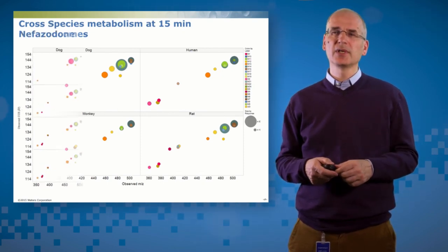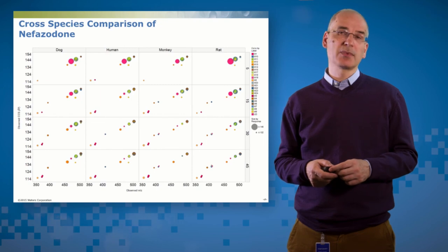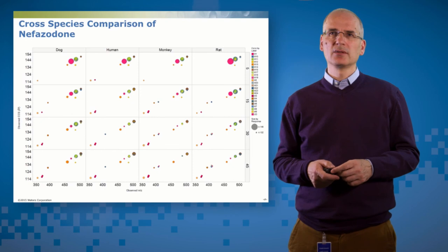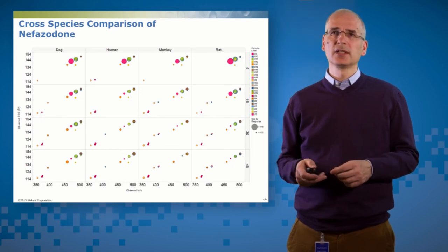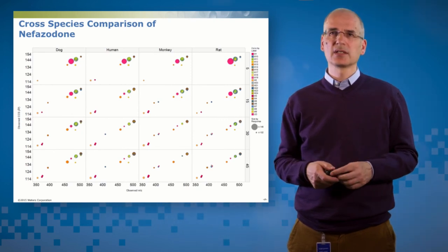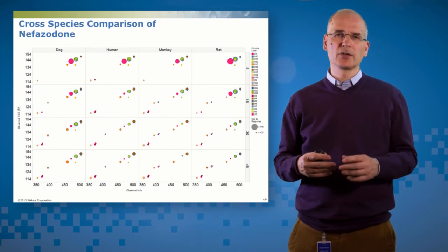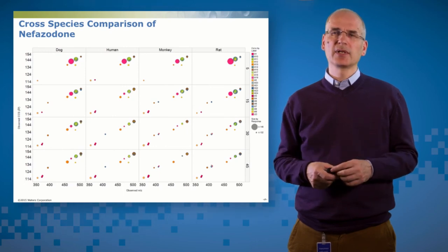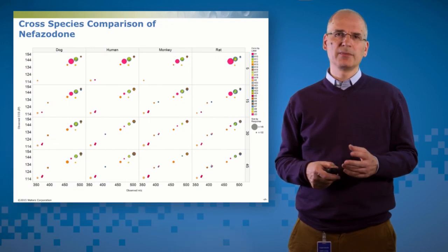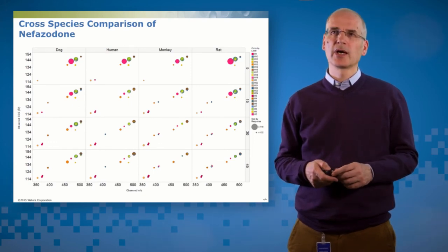Can I go even further than that? Well, here's the same cross-species comparison here, but trellised in two dimensions now. So I'm trellising in x by species, but I'm trellising in y by incubation time. So in this plot, I can do things like this. The red circle at top right in each panel is the parent. And you can see that disappearing as I go down the trace. So that's the disappearance of parent. But I can also track appearance of metabolites as well. Now, you might argue this is overkill, but I think I put it in there just to stimulate thinking about how we can represent these kind of complex multidimensional data sets in a way which is maybe going to be more impactful than the old ways we've used with chromatograms and simple line plots over time.